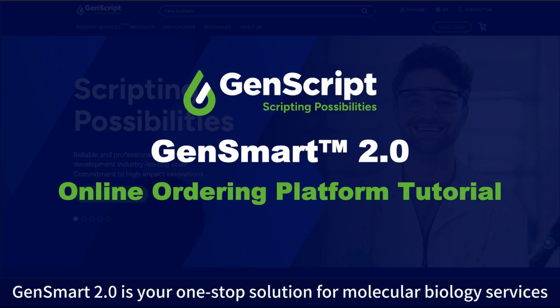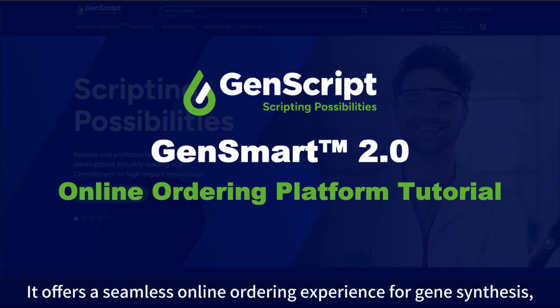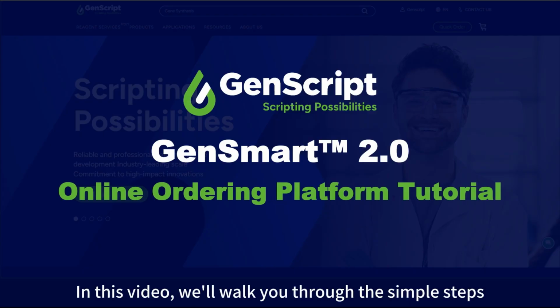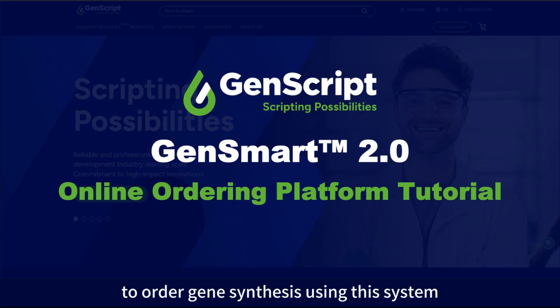GenSmart 2.0 is your one-stop solution for molecular biology services. It offers a seamless online ordering experience for gene synthesis, subcloning, plasmid preparation, and more. In this video, we'll walk you through the simple steps to order gene synthesis using this system.